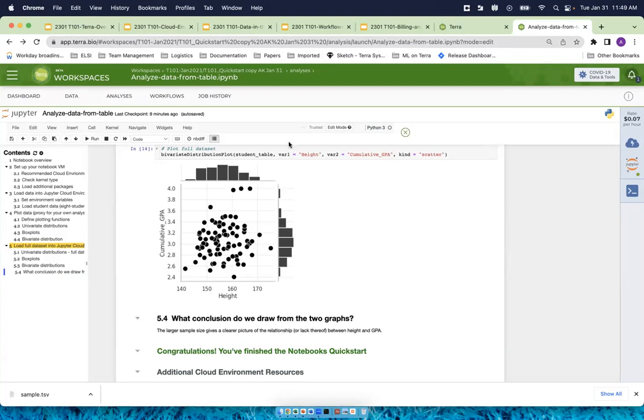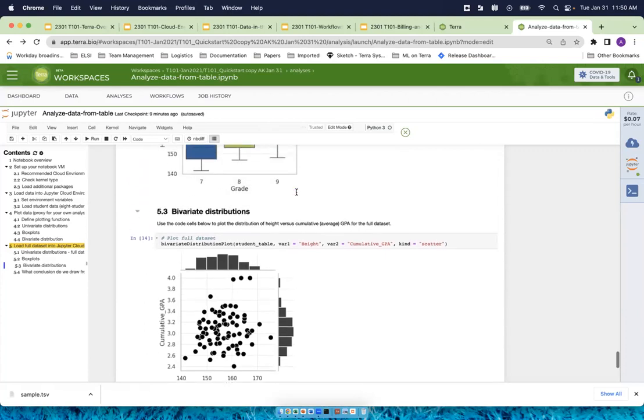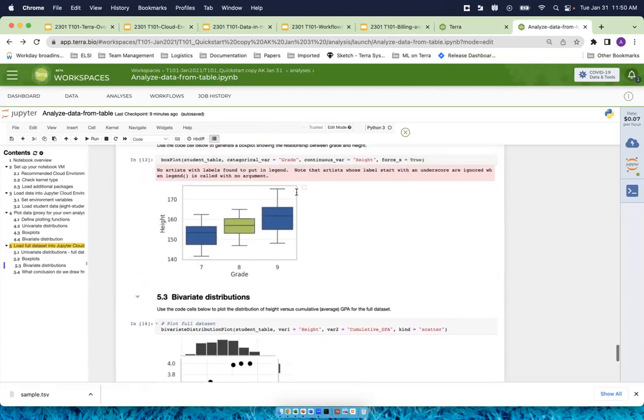And also, in running the interactive analysis, the cell, I don't know how you place the cursor and press the space return to run the analysis. If you can briefly demonstrate that, I will be fine.